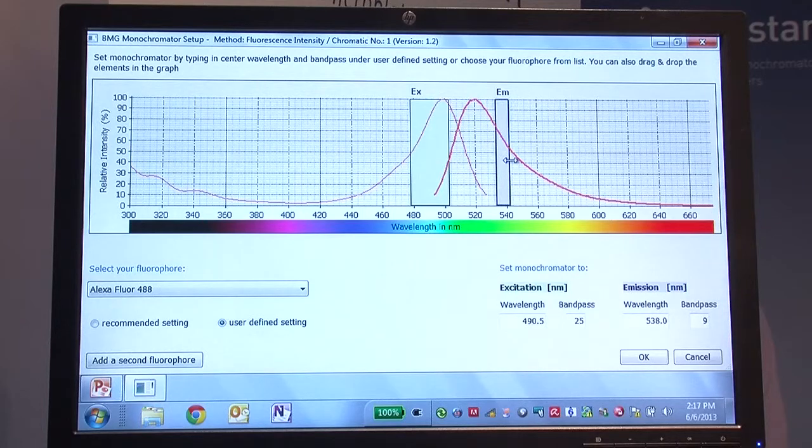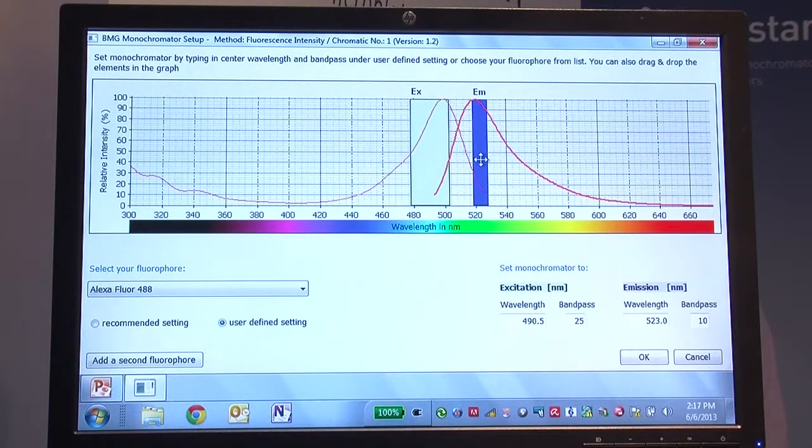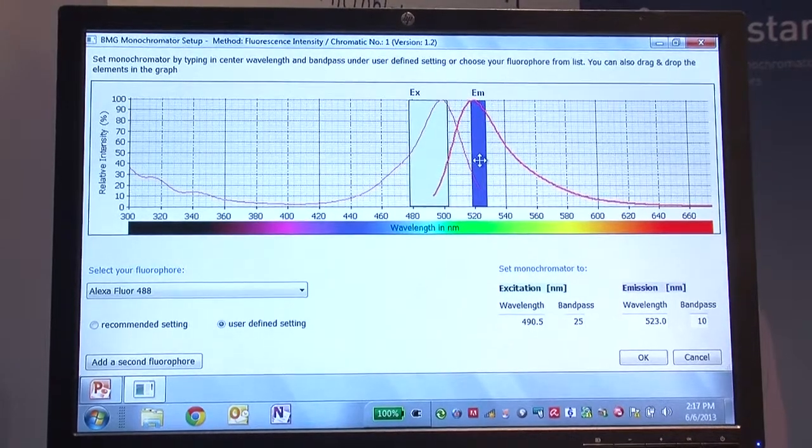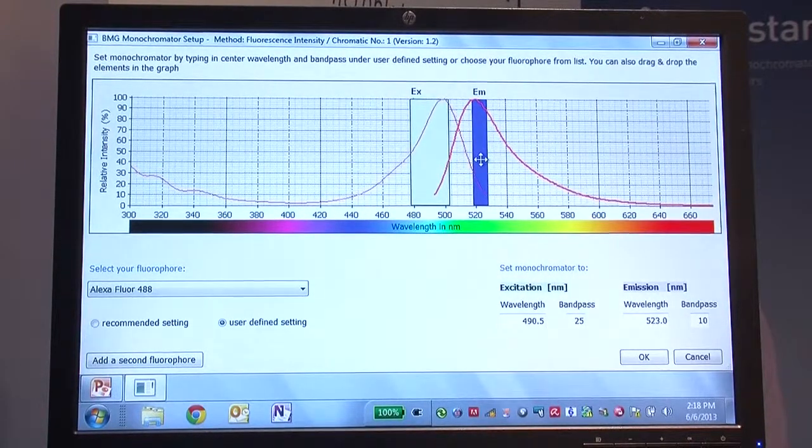You can also adjust the emission bandwidths — very easy to use. Another nice feature of the software is that if you get too close, it gives you a nice big error saying they're too close, pull them apart. So the software has an integrated fluorophore library that allows you to set the optimal settings for the monochromator. As you can see, it is very intuitive, so it prevents you from making errors that could affect your assay.